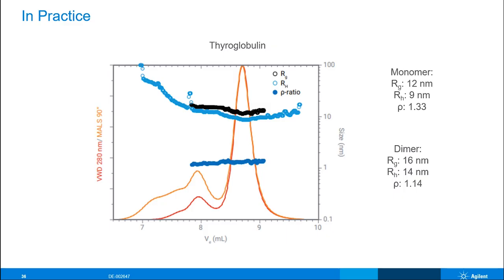To look at another one of our collaborators, in this case highlighting architecture, currently we're working with Professor Todd Emmerich's group at the University of Massachusetts Amherst, and they're using MALS to study complex polymer architecture. Specifically, they're looking at bottle brush polymers. Due to their irregular shape, accurate molecular weight info isn't possible using conventional GPC and SEC type calibrations, but also as these materials grow, they behave differently.